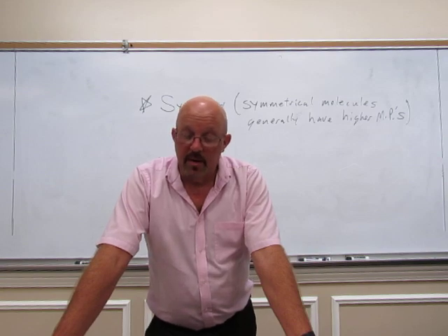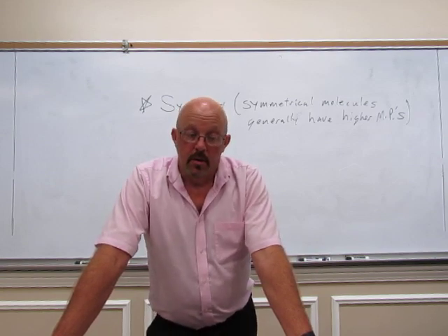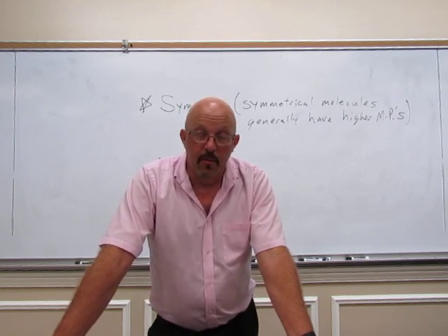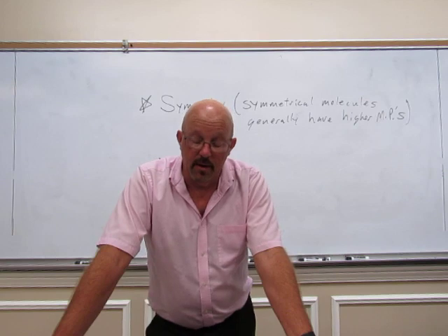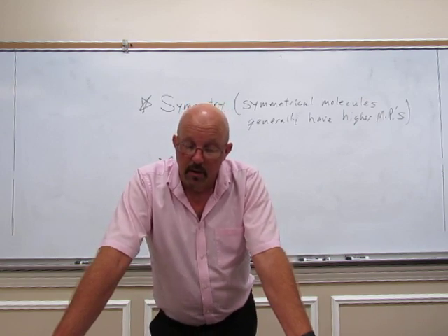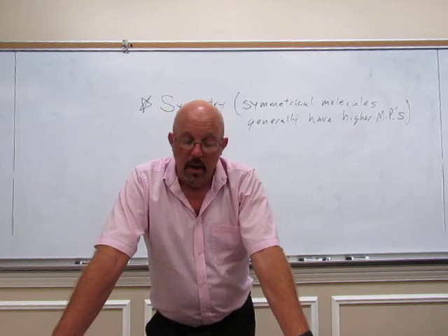So go through the exact same thing again. Put it in your reaction tube. Slowly start adding solvent. Get it up to boiling. Still not dissolved. Add a few more drops. Get it back to boiling. Still not dissolved. Add a few more drops. Keep going until everything's dissolved. Take it off. Let it cool slowly. Collect the crystals on a Hirsch funnel.